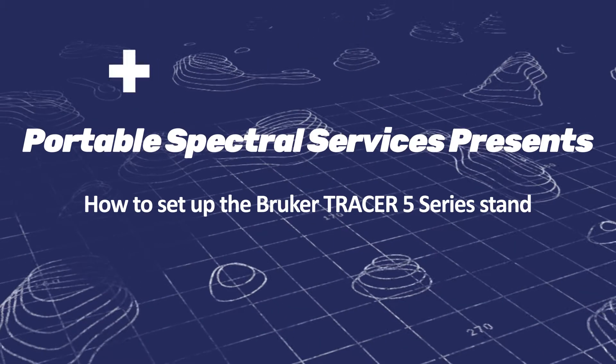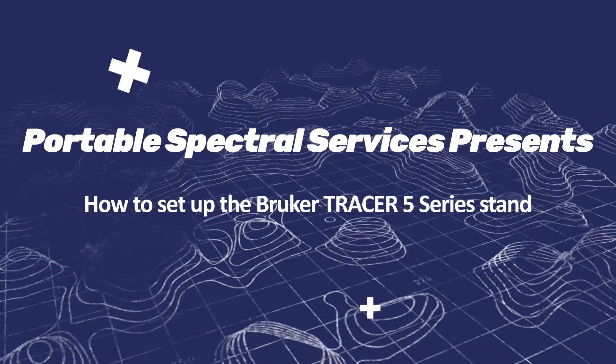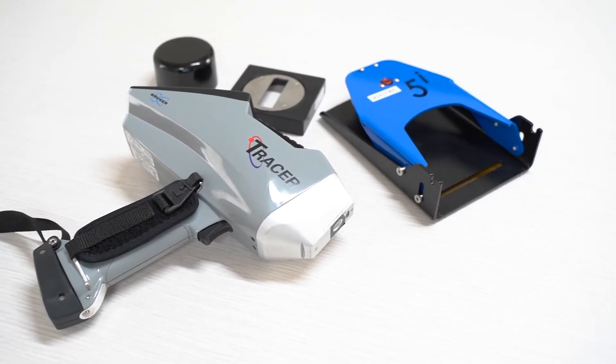Professor Spectrum, experts in spectral technology. Welcome back to Professor Spectrum. Today we're looking at the Tracer 5 Series Stand.